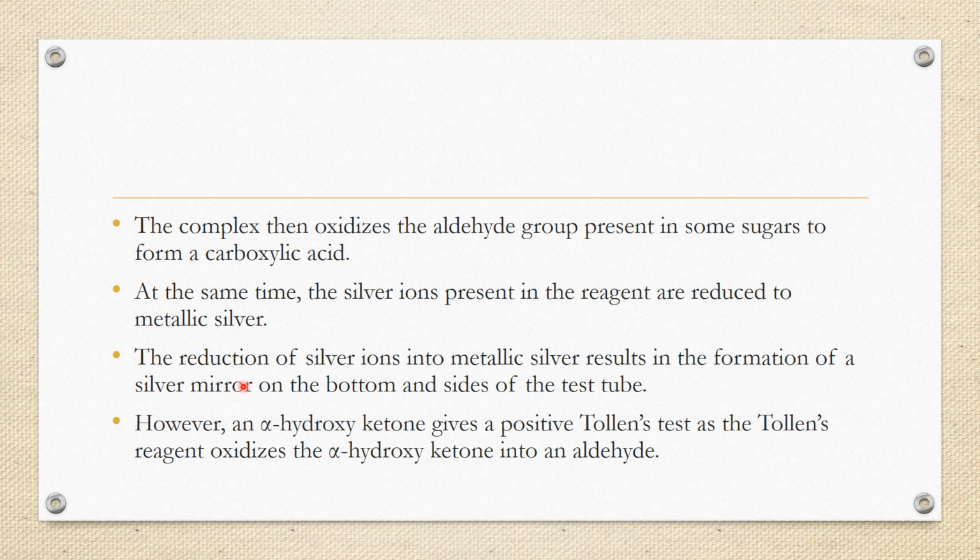However, an alpha hydroxyketone can give a positive Tollen's test, as Tollen's reagent oxidizes the alpha hydroxyketone into an aldehyde, because Tollen's reagent has a strong oxidizing agent, which is the diamine silver hydroxide.